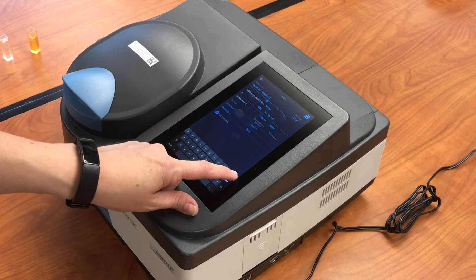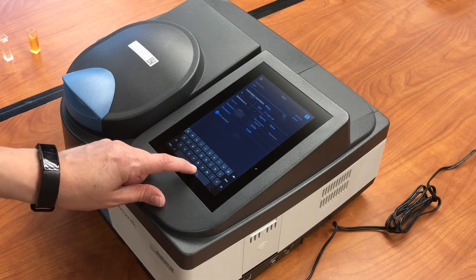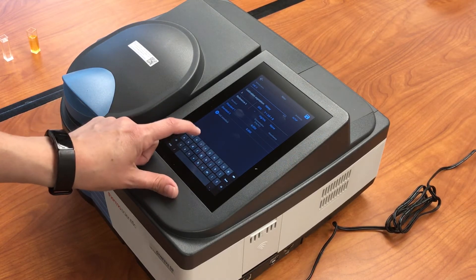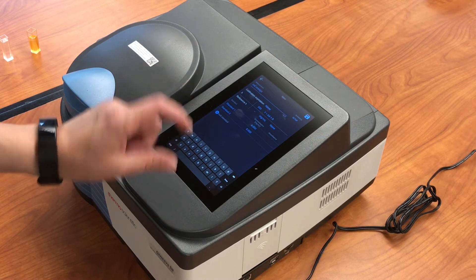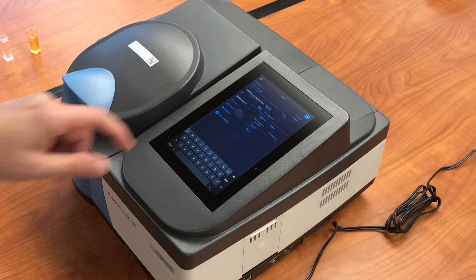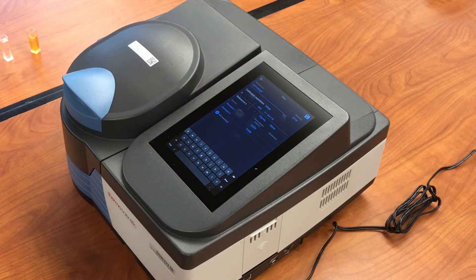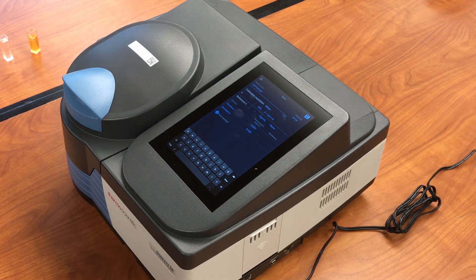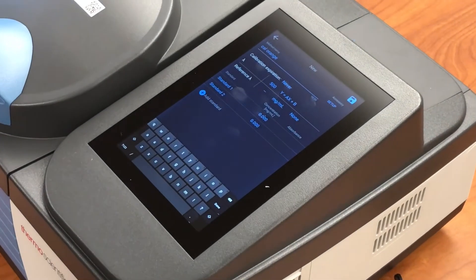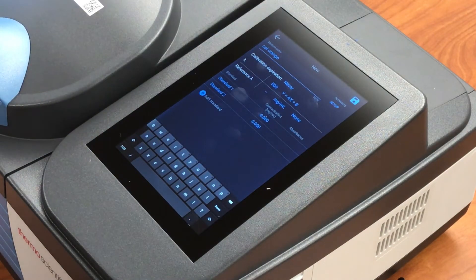Let's give this method a name. We're going to do calibration curve for an orange solution. You could set this calibration to expire if, for instance, you were going to be doing multiple measurements over an extended period of time. You could require that the calibration curve be regenerated at a particular time interval. For now, we're going to leave that calibration expiration at never.